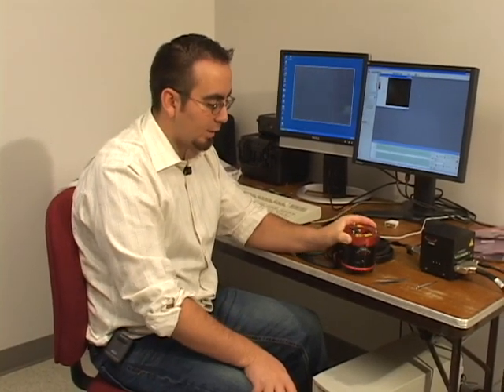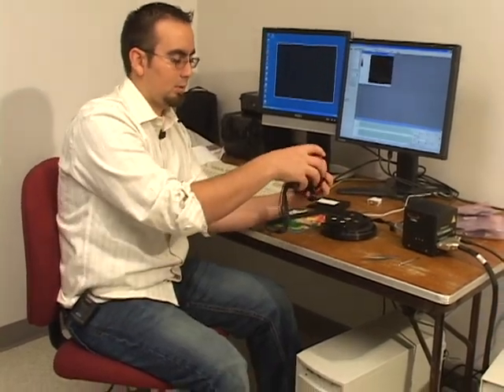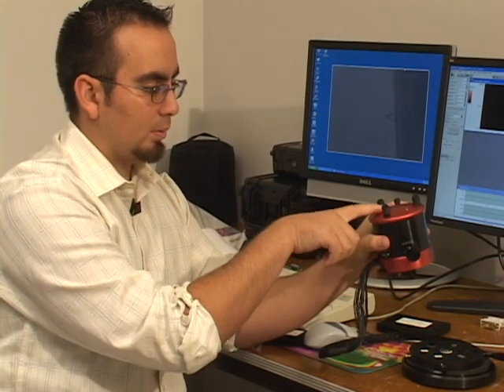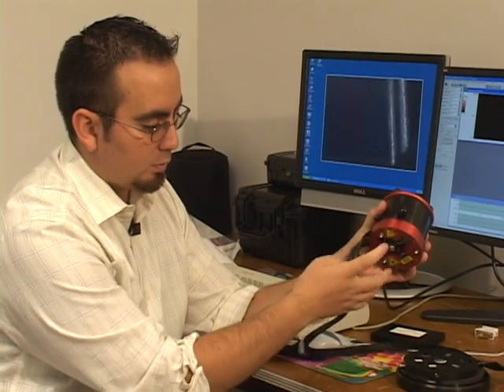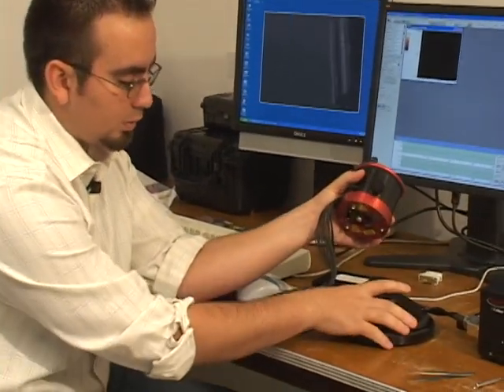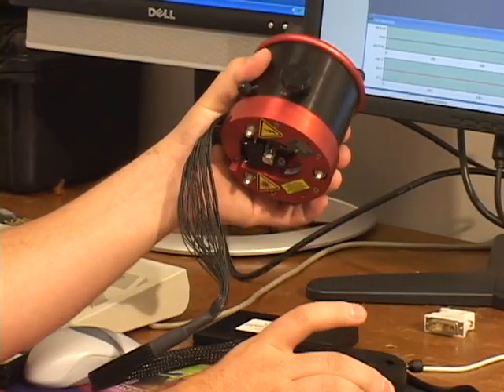Okay, start with the words nicely aligned. So it's nicely aligned. So after you have that placed on there, turn the head over, make the cables face you. That way the motor is actually on the other side of the head. That way you don't confuse which one is the motor and which ones are the manual translation screws. You place the motor screw on the circular part of the XY translation stage first.